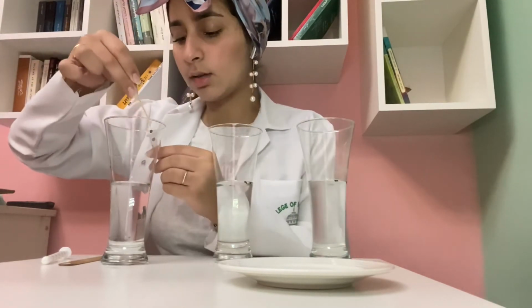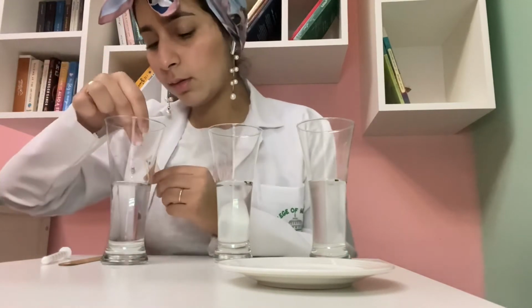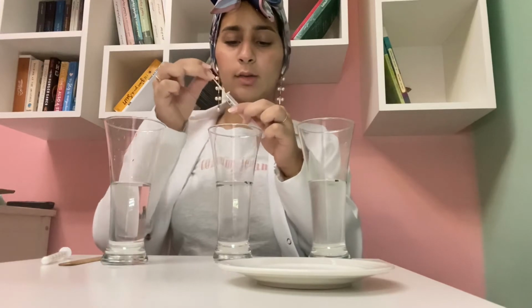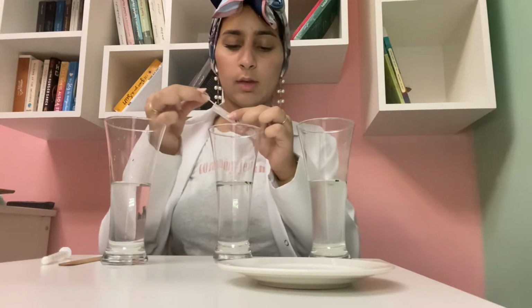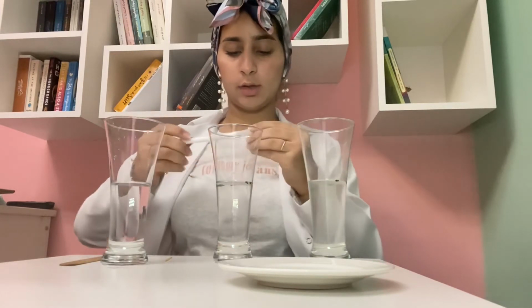This is the third disc. And this is the 4th disc. Now, when we have those discs inside, we're going to try to push them in a little bit, and then we can use this one to tuck them in properly inside.